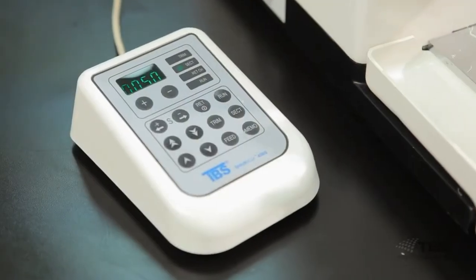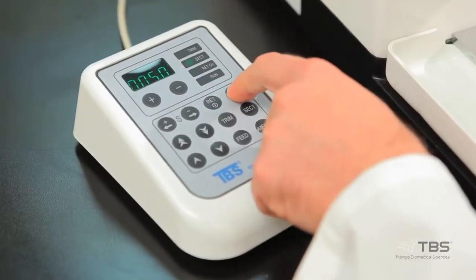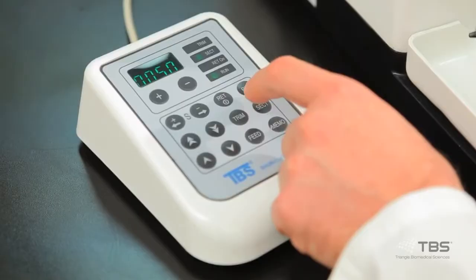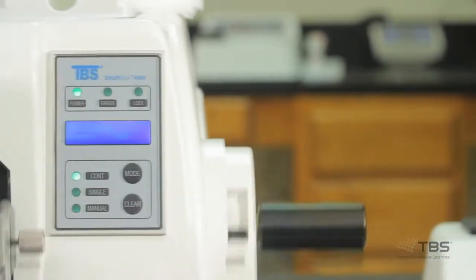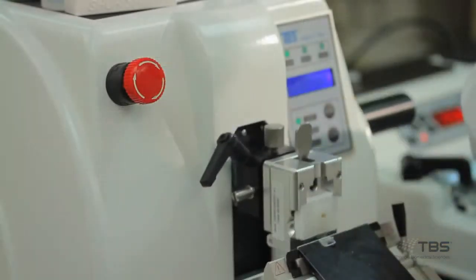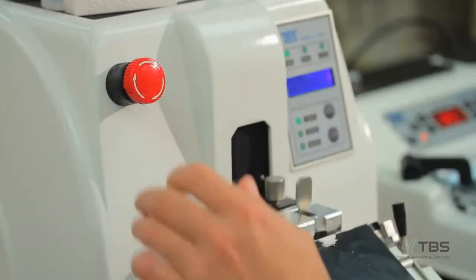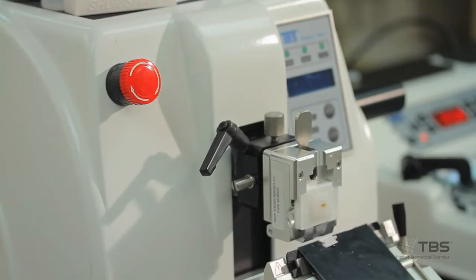Starting these processes is as easy as pressing the run button on the handpad. The instrument display panel indicates which mode is active and, in the instance of an emergency, a readily accessible emergency stop button quickly halts the motor drive.